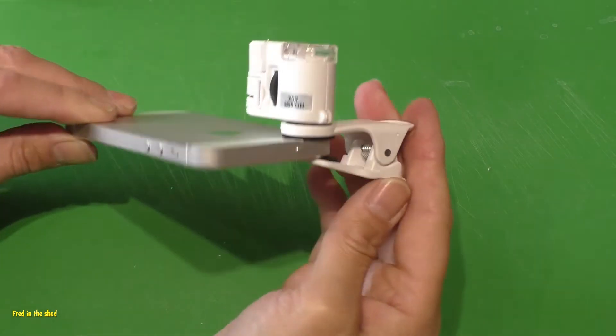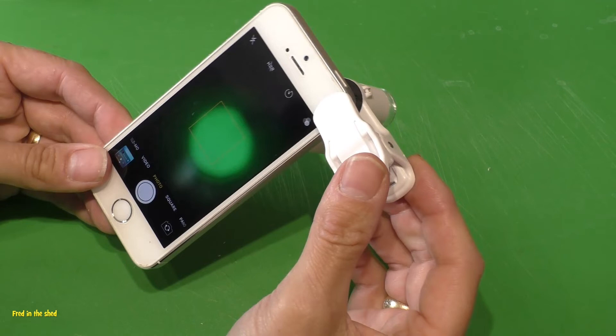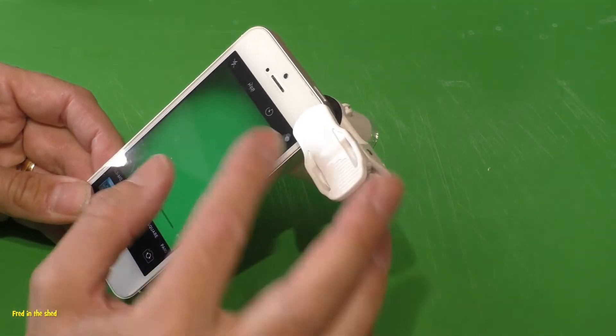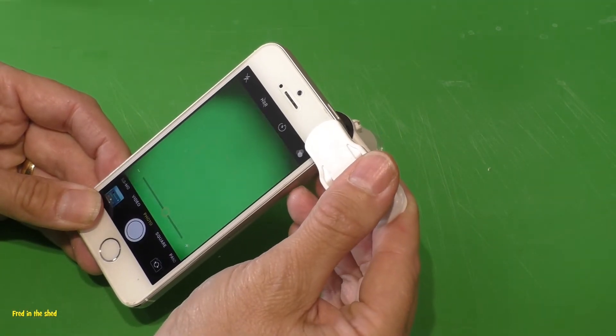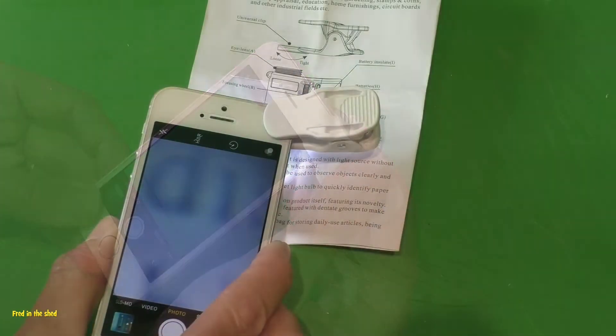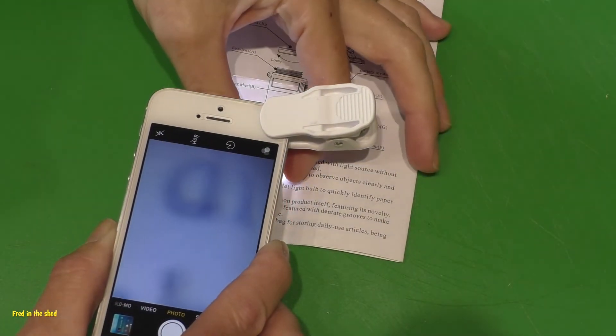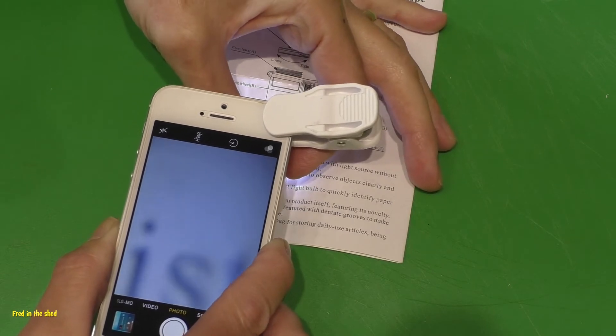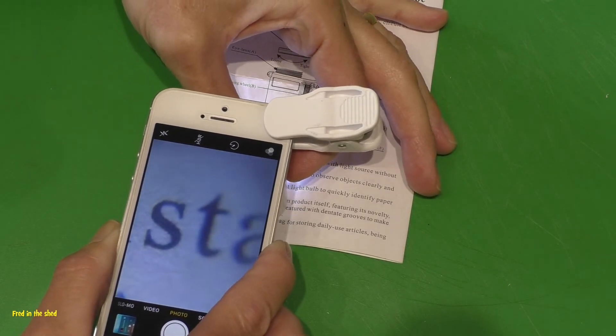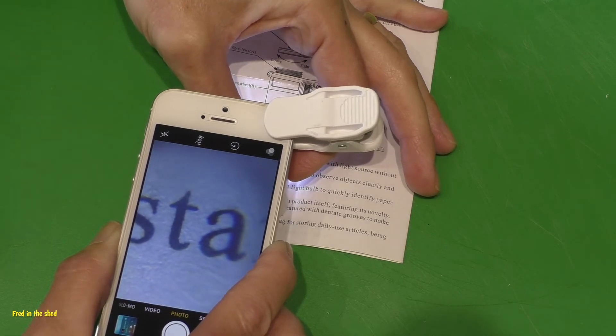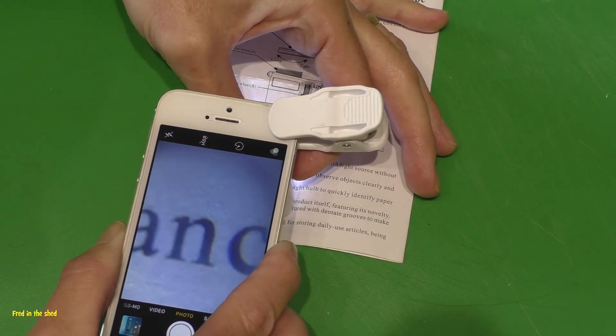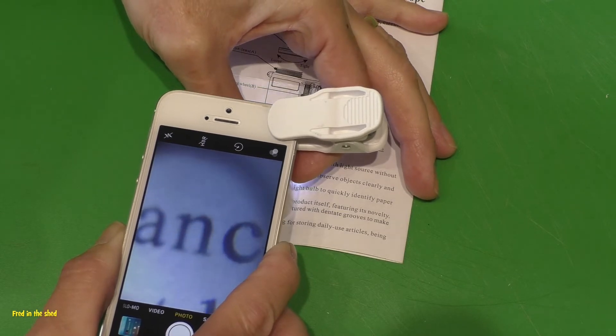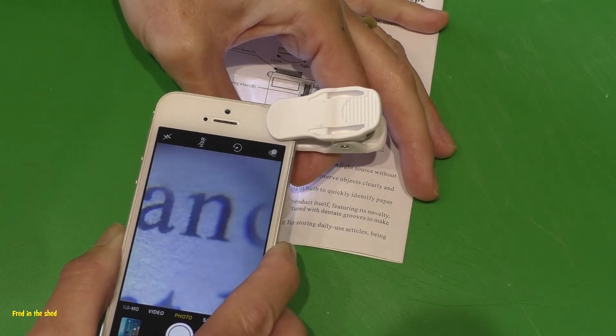This gives you that maximum of 60 times magnification. To be fair, it probably is around about 60 times - I think for once they're being quite honest about that. The built-in white LED light is quite essential once you start zooming in because things can get quite dark. It works pretty well actually - it's bright enough for most objects.